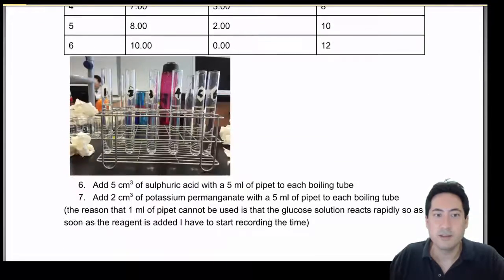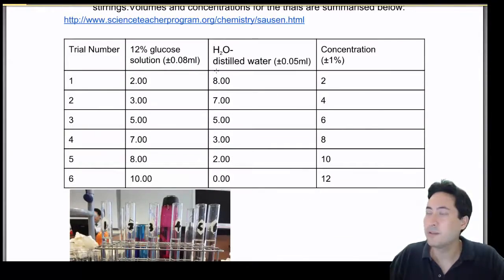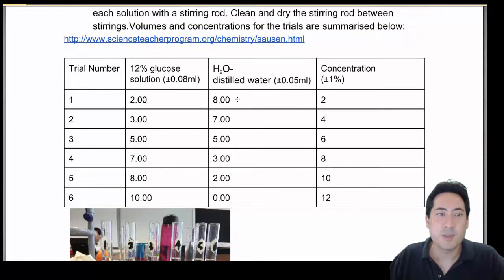Okay. Alright, so how much time have I spent? God, I spent a couple of minutes just working out where your lab is. So, trial 1, 2, 3, 4, 5, 6. Got various glucose solutions.